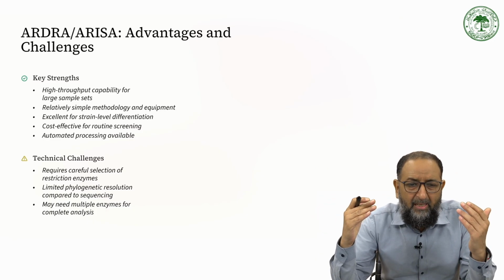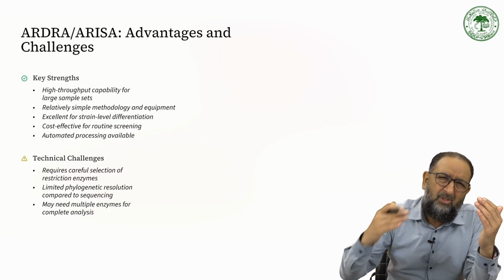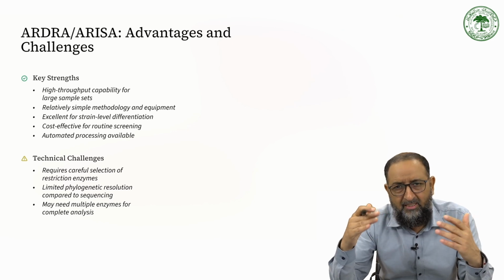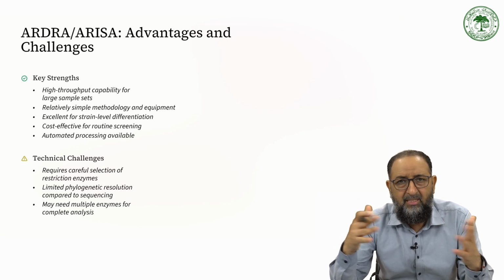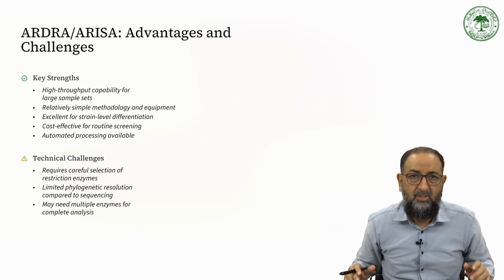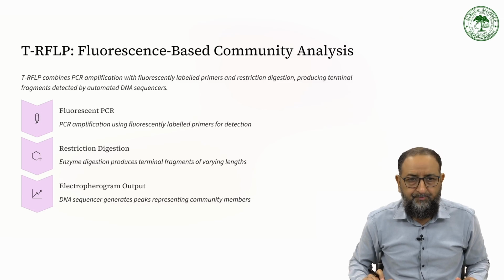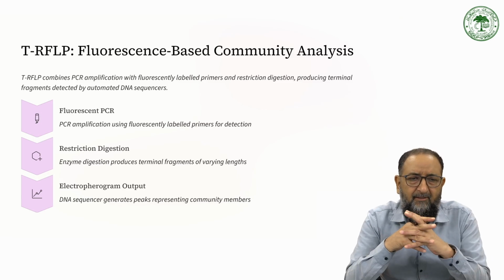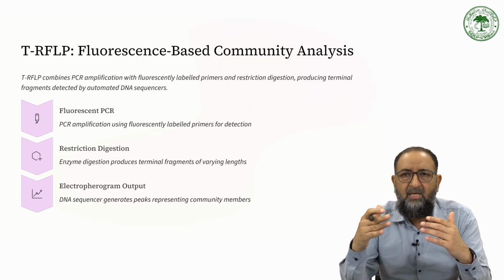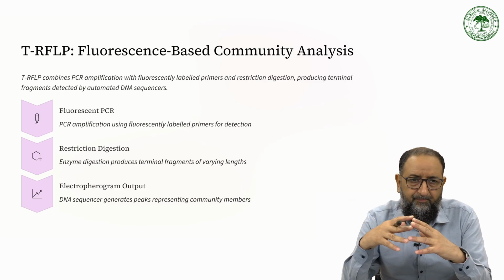It may need multiple enzymes for complete analysis. So you have 1 enzyme, 2 enzymes, 3 enzymes; multiple enzymes are required. Every time you have to set up the reactions and run the reactions, and if you lose one reaction, then your results will be lost. Now, what is the workflow? Basically, the workflow is the same as sequencing: PCR, and then running the gel after the digestion.